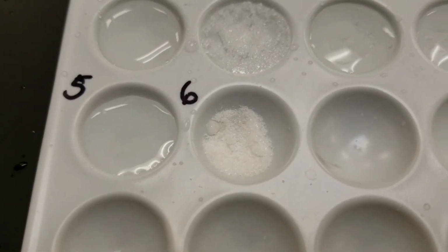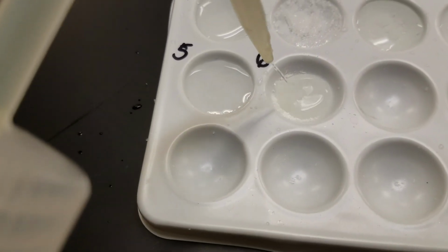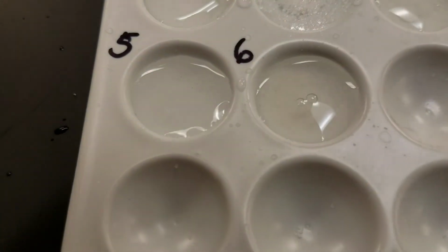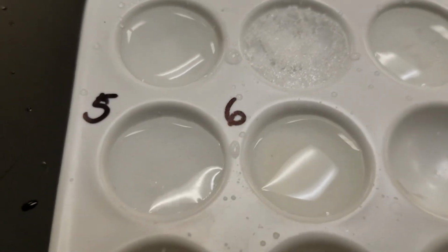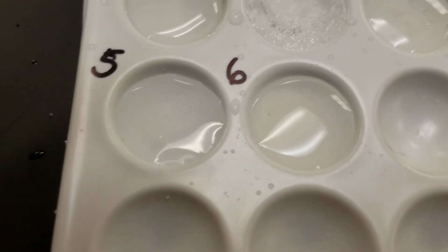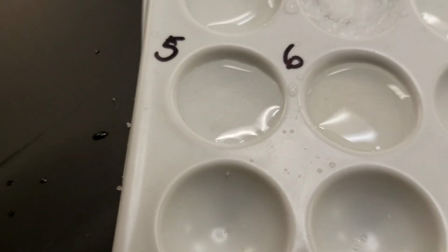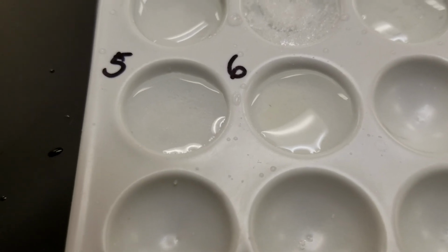Let's go to the last one, ascorbic acid. So number 6, ascorbic acid, it looks like some of it dissolved, but not all, so partially dissolved.